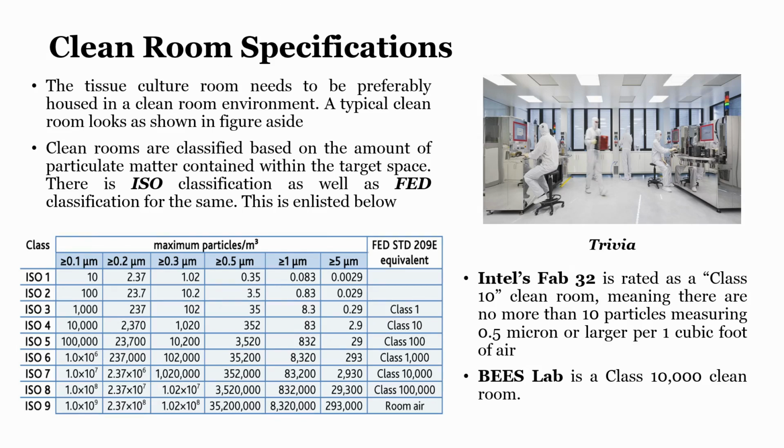In the same way, our laboratory environment is somewhere around ISO 9. But if the laboratory has a positive pressure module, which we will see in the following slides, and I will show you actual positive pressure modules with HEPA filters in my laboratory, we can bring the class down to class 10,000. The one that you see on the screen is a class 1000 kind of clean room.